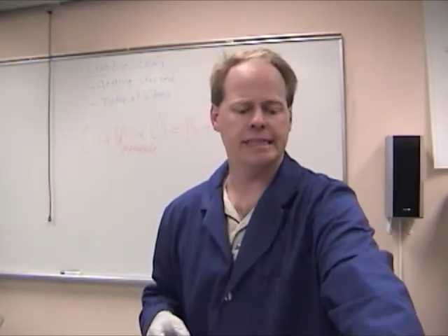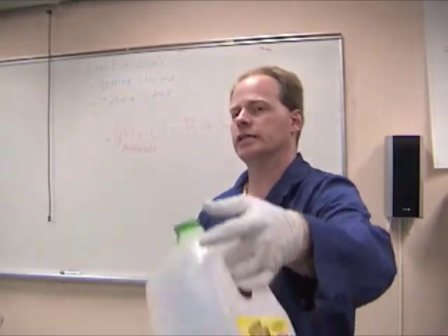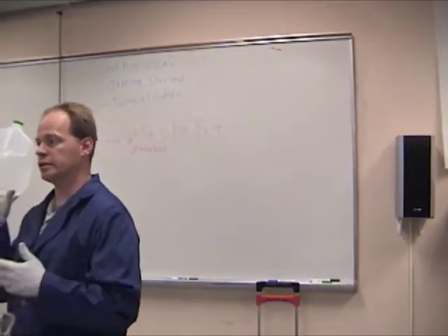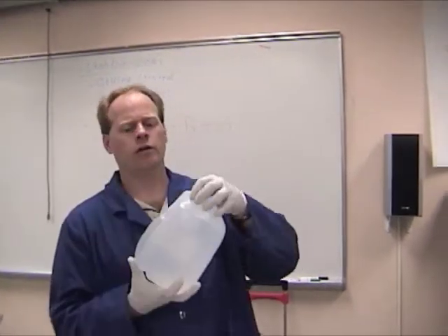You need some distilled water. Distilled because we want the pH of the water as pure as we can. We don't want acidic or basic water because it'll throw off our titration.